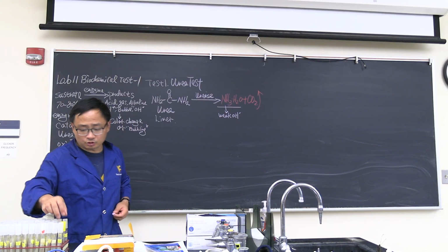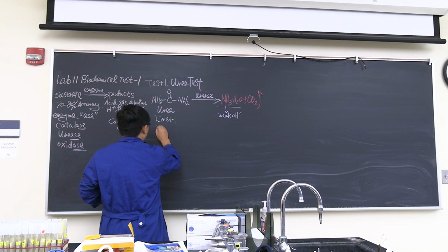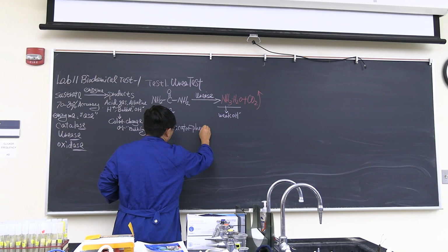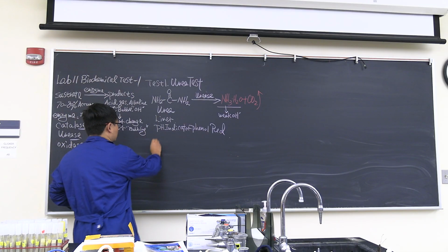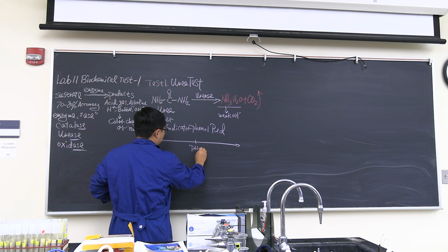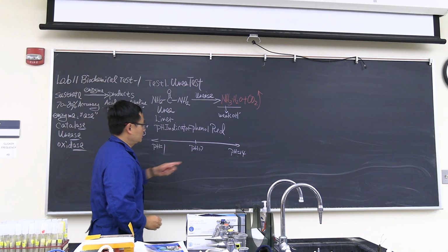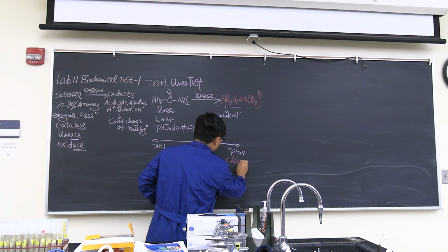Because in this tube, we add something there. Add a pH indicator, which is called phenol red. And phenol red, it is very interesting. If I have a pH at 7, pH at 14, and this is usually pH at 1, pH at 14, it is cherry red.